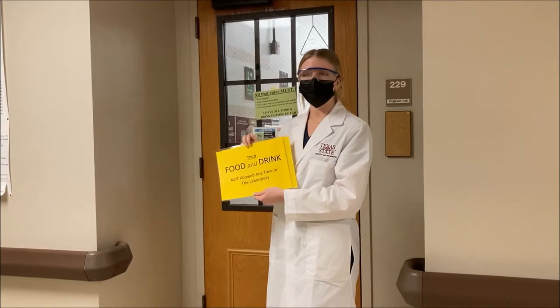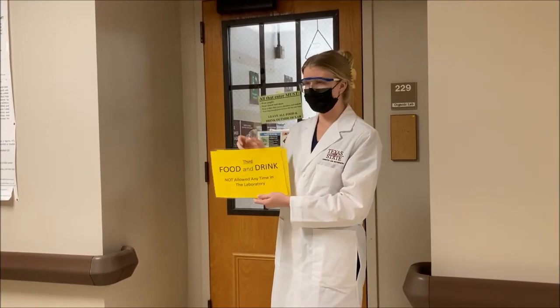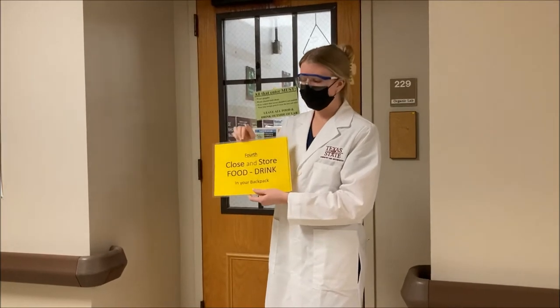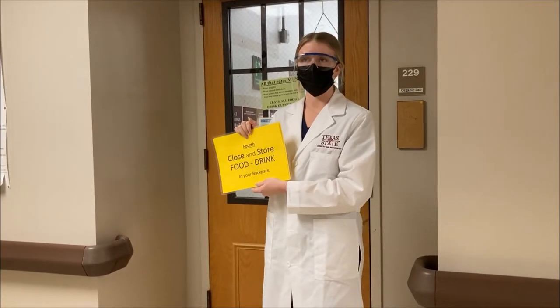Before you come into lab, you need to make sure you're leaving all food and drinks outside. If you are bringing anything with you, it needs to be closed and stored away in your backpack.